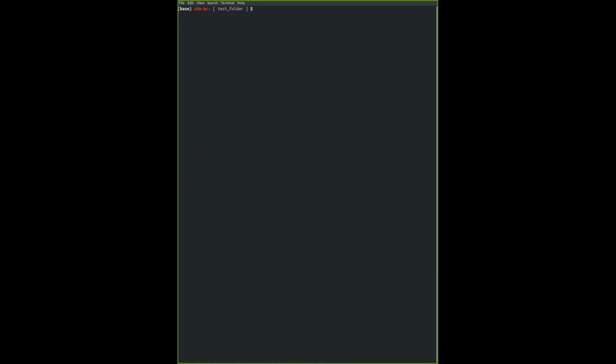Okay. So once your file contains some sort of content, some sort of information, you can preview or view the file in terminal. To view the entire file, the function is called cat. I still can't figure out why exactly it's called cat, but I think it's concatenate, or basically stitch things together, if I'm not mistaken. But the function is called cat followed by the name of the file. So it's test_file. I'm going to auto-complete this, and you can see that all 24 lines are printed.